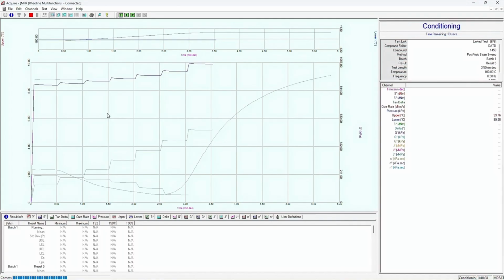This specific test is highly useful for determining several other characteristics of your cured material, such as the structural strength and the yield point. As strain increases past a critical point, the material structure begins to break down or yield. This test shows us exactly how much deformation or critical strain the cured network can tolerate before it begins to break down. And finally, cross-link density.